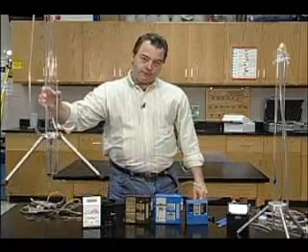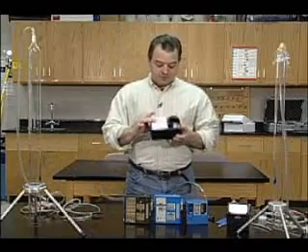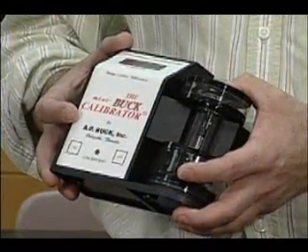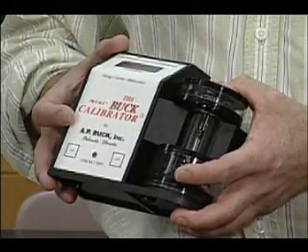Unfortunately, these are a little tough to go into industry with. So science has invented a pseudo-primary standard called a buck calibrator, and Gillian also makes a gillibrator.